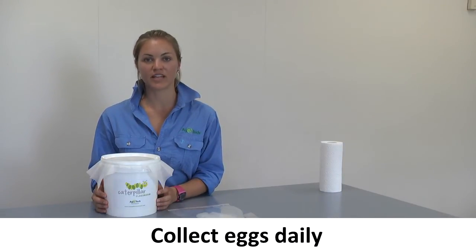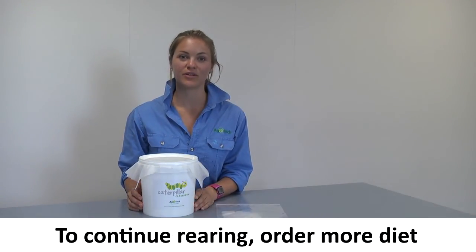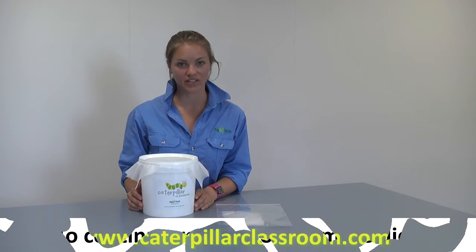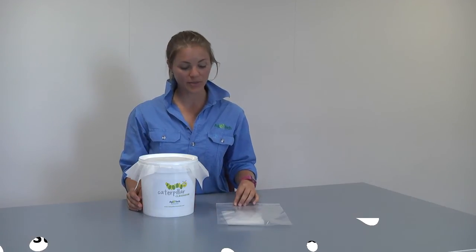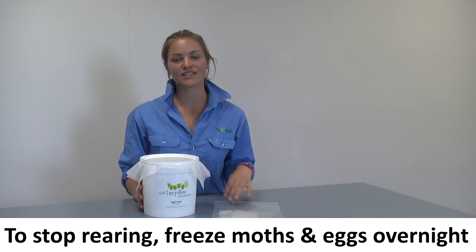The moths will typically continue to lay eggs for three to five days, after which egg production will decline and the moths will begin to die. If you wish to hatch your eggs and continue rearing your Helicoverpa for a second generation, visit the Caterpillar Classroom website to order more diet. Alternatively, if you wish to cease the project, place your bag of eggs and your moth bucket in a freezer overnight — this is a humane way of discarding your insects.